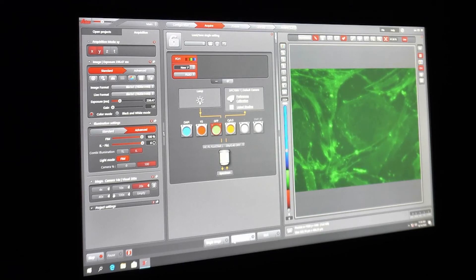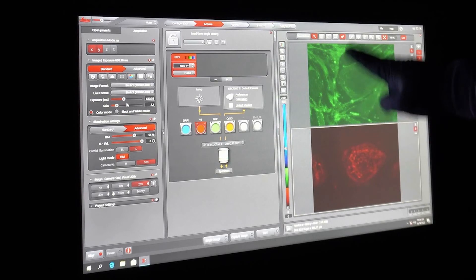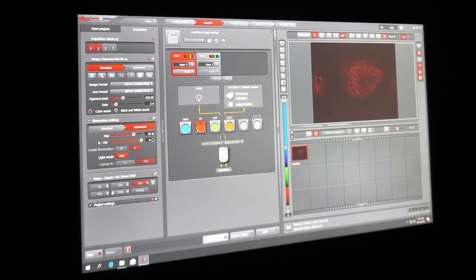Once you are happy with it, capture the image. Depending on the capabilities of the microscope, you may be able to view both channels at the same time. This is quite helpful for ensuring that you are viewing the exact same area of the well for both channels, and you can compare the two types of staining directly. You can see that none of the MEFs have stained for TRA-1-60. Here we can also see the edges of two other iPSC colonies as well as the main one that we focused on. Once you are happy with the settings for both channels, you can merge the images together to create a single image.